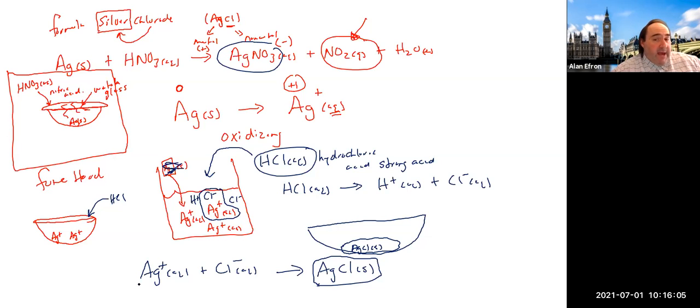So that is how we're getting both the silver and the chloride together in this reaction. It's basically two reactions. We're going to first react the silver by itself with the nitric acid. That's going to prep the silver, if you will, into silver with a +1 charge, make it really a cation, able to be floated around in the solution.